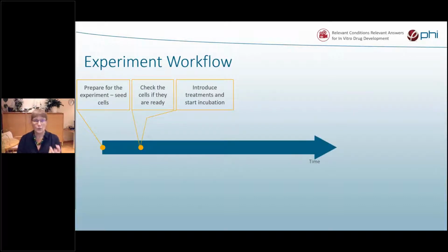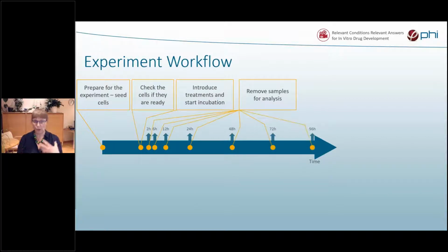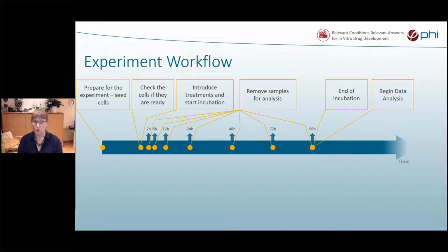And during the incubation period, you will remove samples intermittently for analysis. Every time you do that, you will disturb your cell cultures, the remaining ones. And then at the end of the incubation, you still have data analysis to go through.